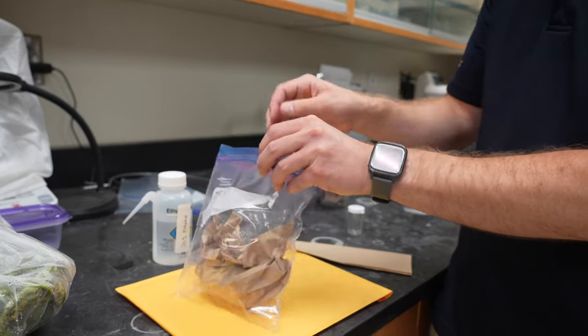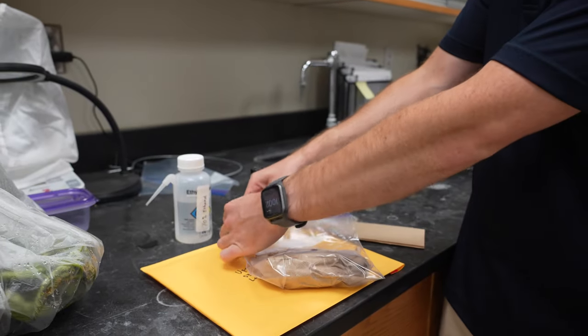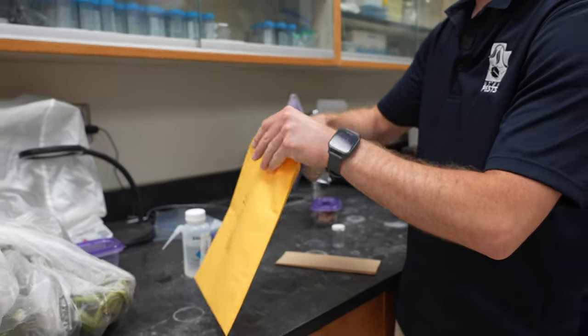Place that in a sealed zip bag, and then you can place that bag in a mailing container to ship to the diagnostic lab.